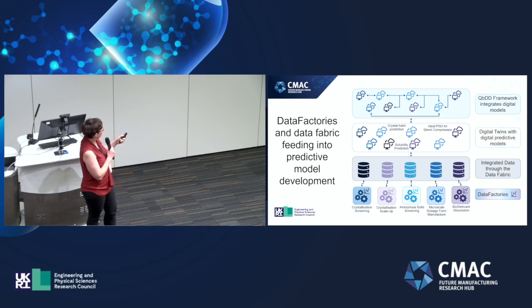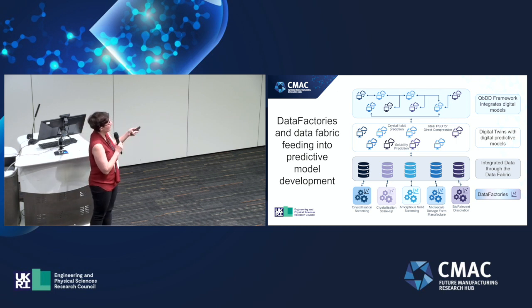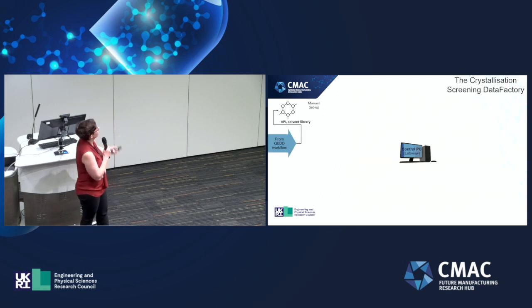So what I'll talk about today is the crystallization screening data factory. But you'll see the crystallization scale up at stage 1 of the lab tours. You heard about the amorphous solid screening from Michael yesterday, and you'll hear about it a little bit more in this section. And the microscale dosage form from DM squared, and the biorelevant dissolution from Hannah's flash talk yesterday as well. So what's the crystallization screening data factory?